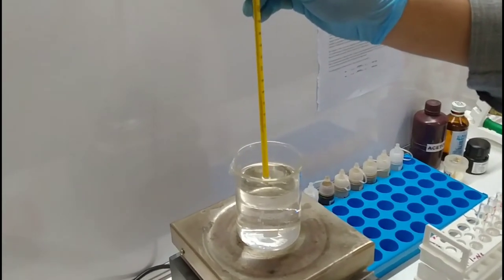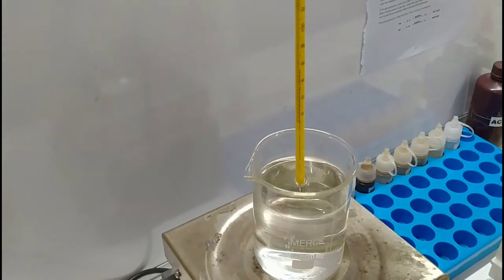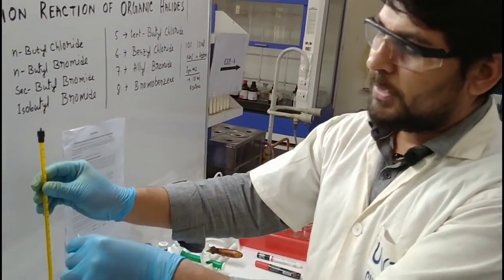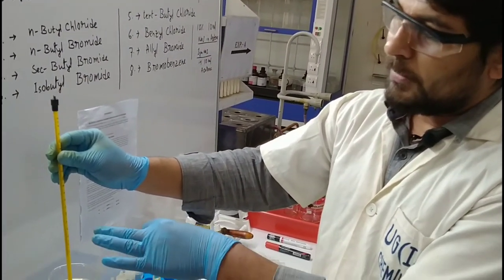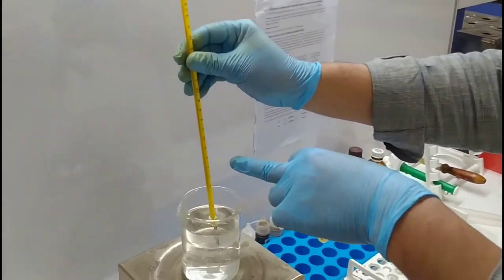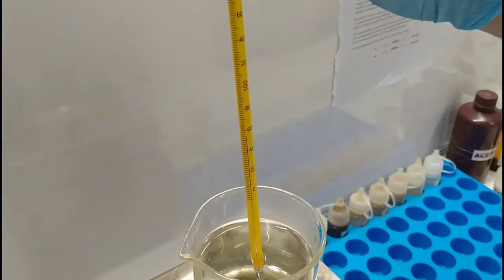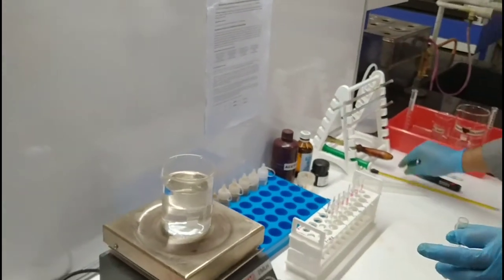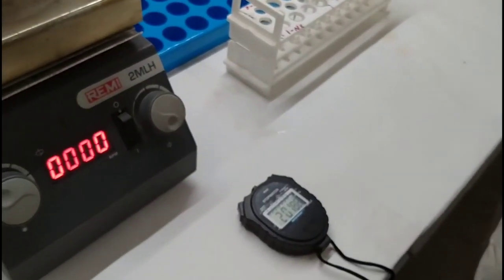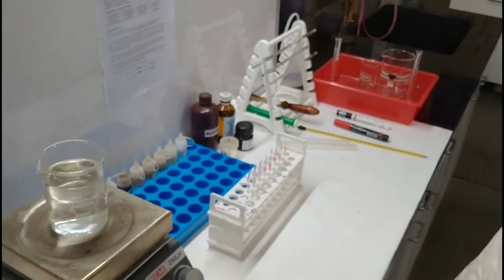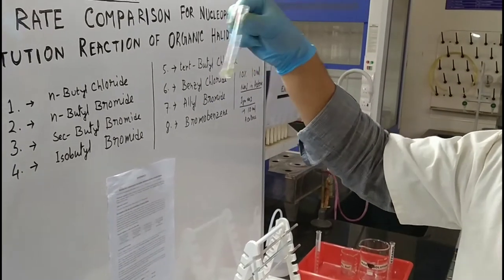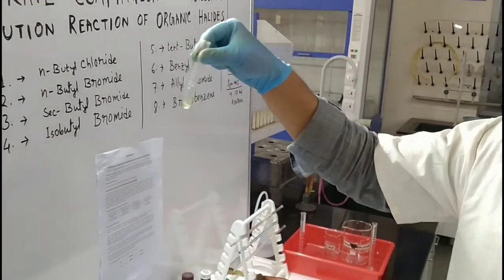Generally, we have to wait 4 minutes at room temperature. If we get a precipitation within 4 minutes, fine. Otherwise, we have to heat this test tube in a hot water bath at 45 to 60 degrees. The water bath temperature is around 60 degrees. At 1.2 minutes, still no precipitation. If it's not showing any precipitation after 4 minutes, then we use the hot water bath.